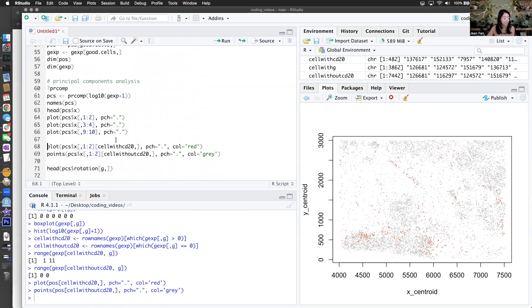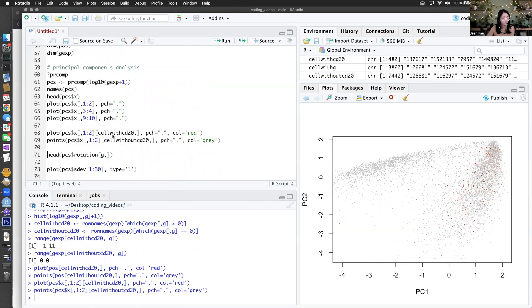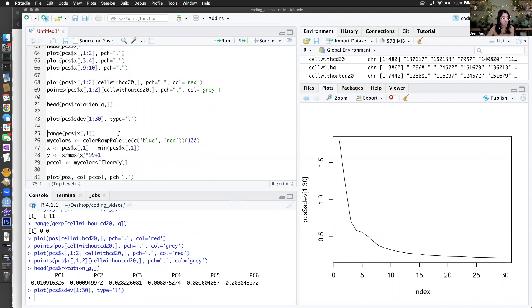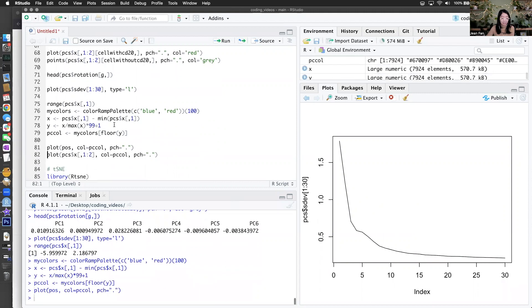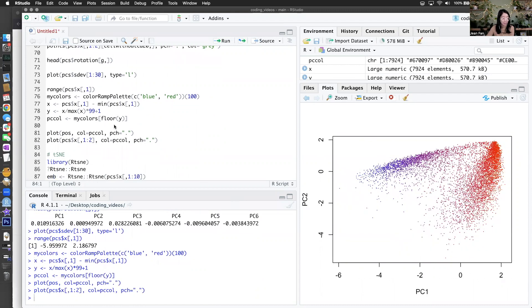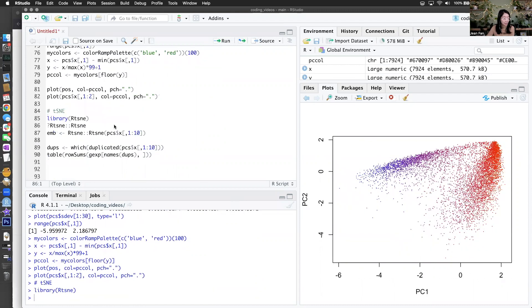We can still look at PC1 and PC2, and the CD20-positive cells are still kind of localized to one of the clusters — mostly separating on PC1 and variable on PC2. Everything looks the same as before, even though we filtered out the cells that were not expressing anything. This still looks kind of the same as before. So I think hopefully that fixes things.